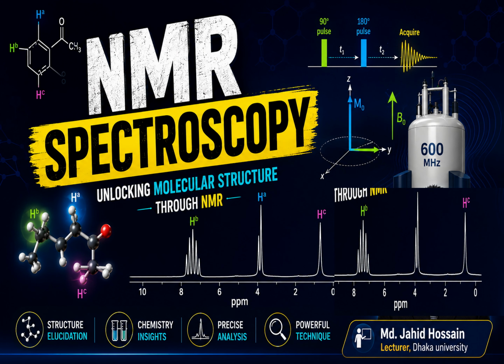In the previous video lecture, I showed the basics of NMR spectroscopy with the history, the instrumentation, and some structural elucidation by this spectroscopy. Now, in this video, I will discuss the basics in depth. So, let's start.